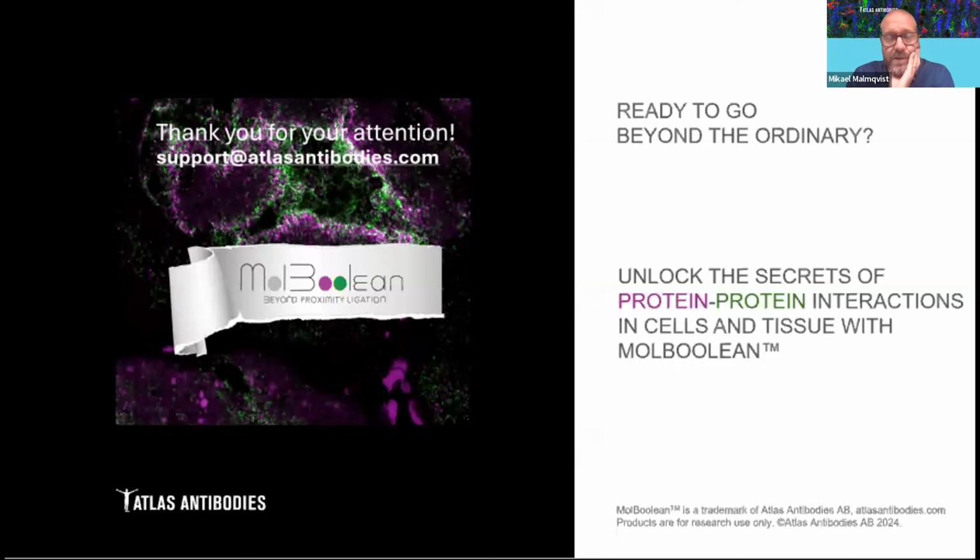It's always good if the primary antibody provider gives you the actual epitope that your antibody binds to, because then you can look at this database to see whether the epitope sequence is far away from where the two proteins interact in the tertiary structure. So again, it's very good if you know the epitope where your antibodies bind, but not all antibody providers can provide that, unfortunately. So that's important to know.